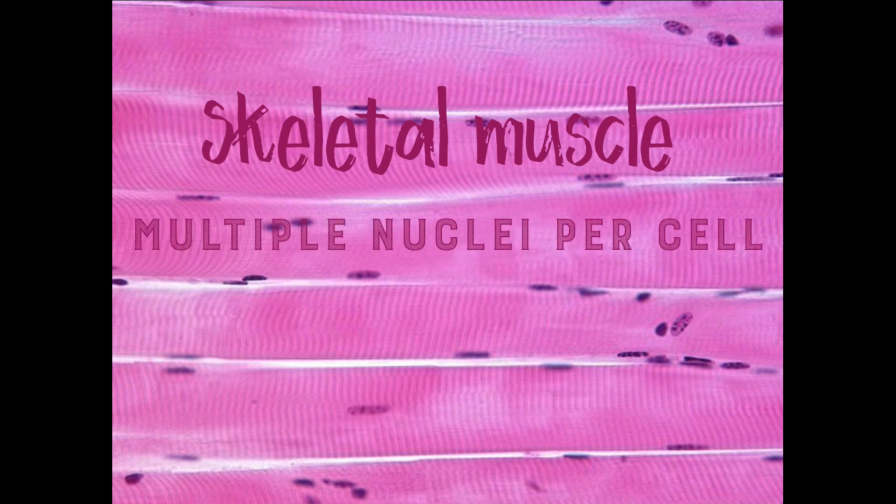Okay. Now another thing to notice is the very dark oval-like shapes that you see, the dark blue or purple. Those are nuclei, and each muscle fiber has multiple nuclei per cell. And you'll notice that the location of the nuclei are kind of on the outside near the plasma membrane.